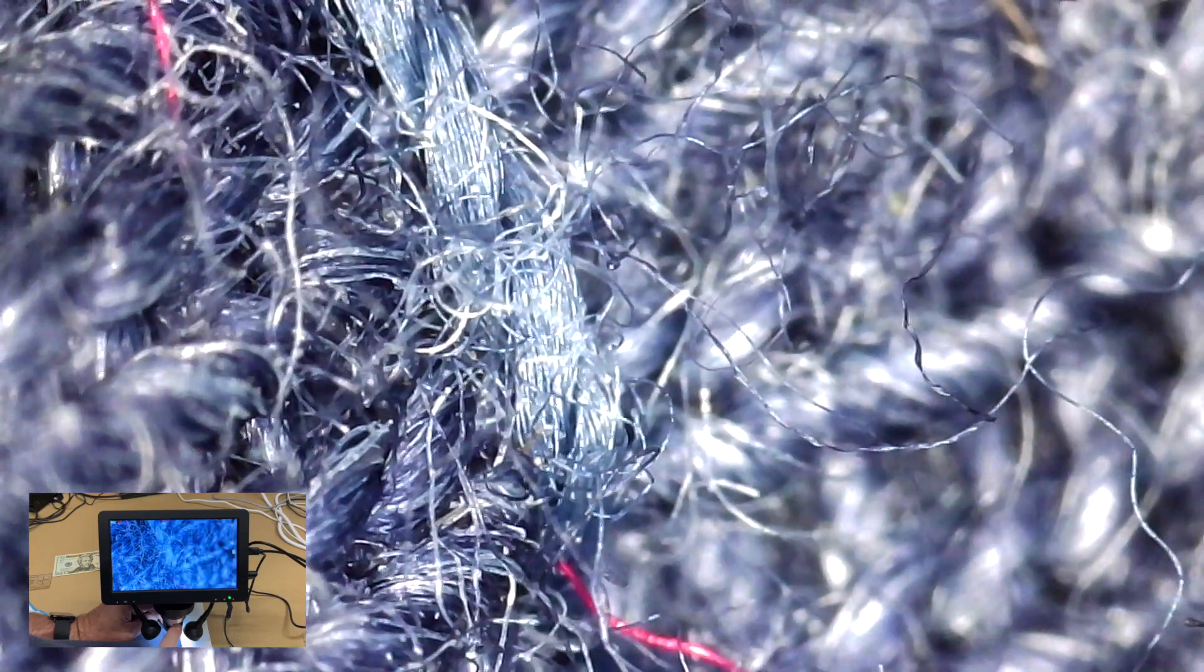Of course, a dark fiber is going to show up a little better. Let me see if I can get my t-shirt in here. So here you can see the fibers in my t-shirt.